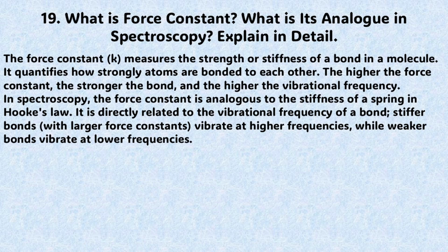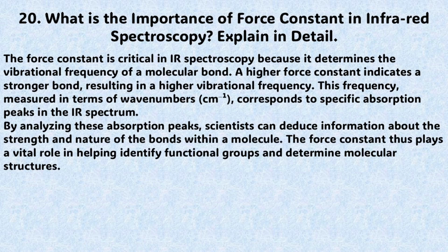It is directly related to the vibrational frequency of a bond. Stiffer or stronger bonds with larger force constants require higher energy to vibrate, which means these will vibrate at higher frequencies, while weaker bonds will vibrate at lower frequencies as a lesser amount of energy is required for their vibration.